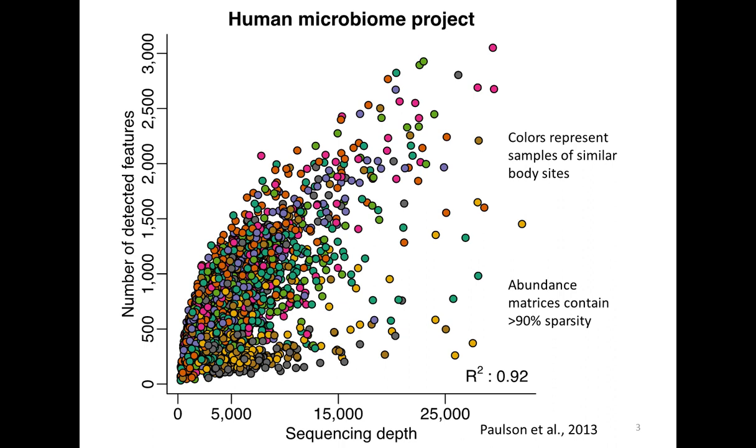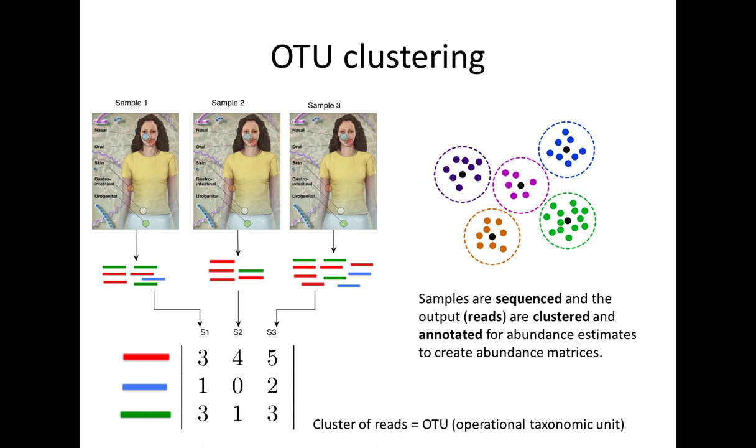0 belongs to some sort of technical distribution, that, okay, there was an earthquake and the sequencing machine didn't actually spit out enough information, or that particular run went really well and we expect that all the zeros in the matrix, I'll go over this again in a couple of slides, are real, biologically meaningful absent bacteria. So these are the main issues that are really present in microbiome marker gene surveys, at least for me from an analysis standpoint. And it seems to be a trend coming out with single-cell sequencing and other assays that might or might not be relevant.